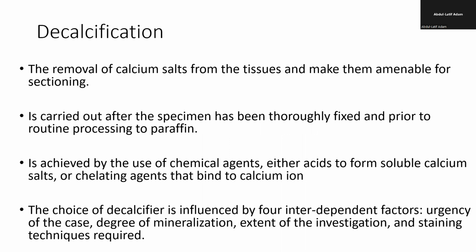Occasionally, there is a special way that you want to study calcium in the tissue, and then you don't decalcify. But for any normal microscopy, you will decalcify.